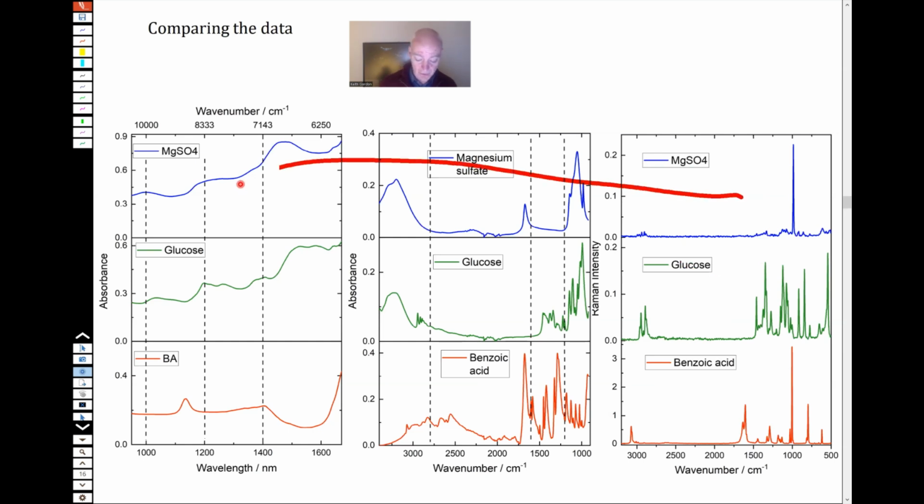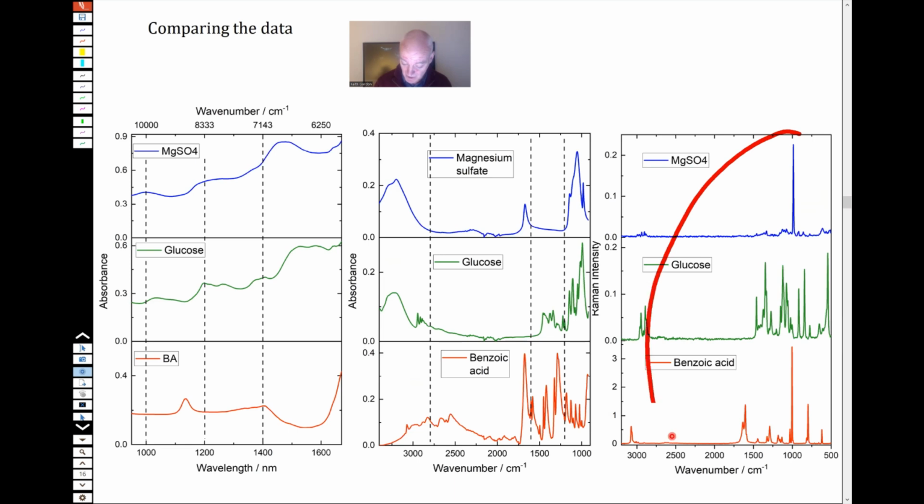So if you use all this material together, it's called data fusion, you could get very, very powerful and advantageous separation. We're not going to do that because we don't quite have time in the experiment to do that. But it just gives you an idea of how these different techniques can work together in a very powerful way because they give rather different responses. That's what's important. So in the case of the Raman, we see these very narrow bands, very distinctive, sort of high resolution.